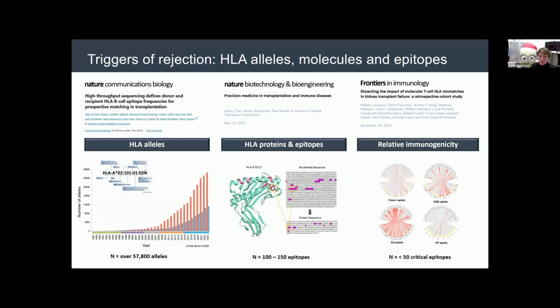We also know that the faster turnaround time with modern sequencing means that we can find matches faster and process transplants faster, which is critical for transplant survival. Having high resolution also allows us to increase the donor pool. The ability to type to a high resolution has expanded the effective donor pool, especially for ethnic minorities who are less represented in traditional registries.